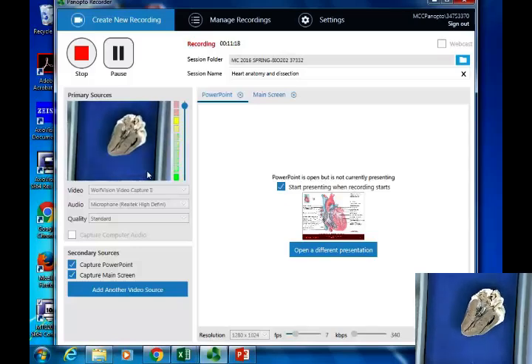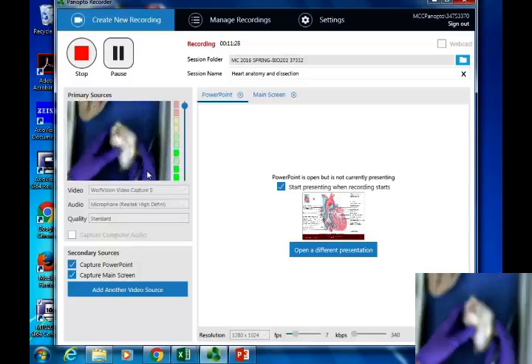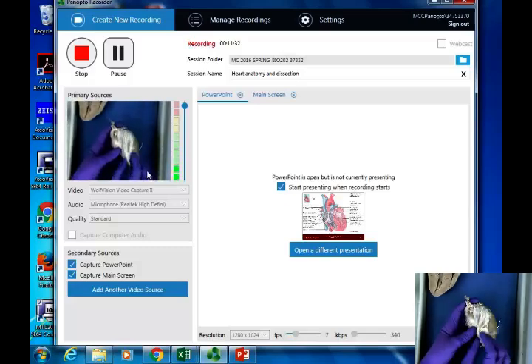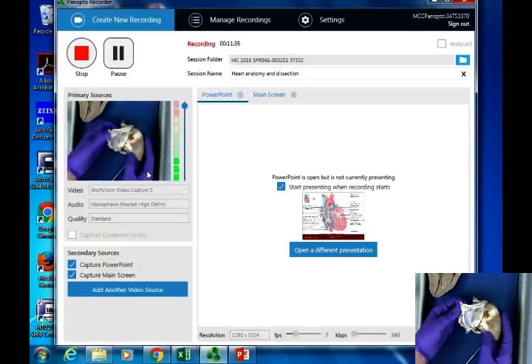Other things that we have, we do have a few hearts that actually have a pericardial sac still attached to them. So, out of the way, here's one that has a pericardial sac still attached to it. So it's right here. It's this connective tissue bag, like you see here, that I'm peeling back. Okay? So this is the fibrous pericardium, or the pericardial sac. So if you got it on the lab practical, it would look just like that, peeled back like that, and it'd say name this bag or sac or something.